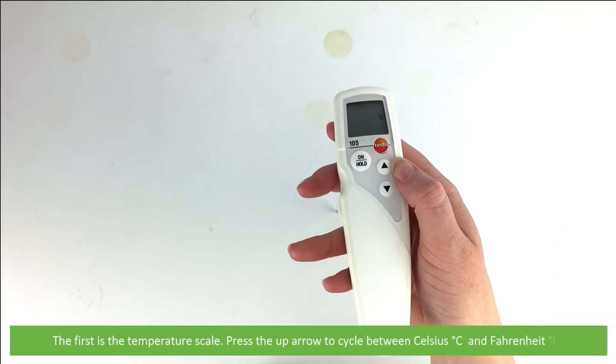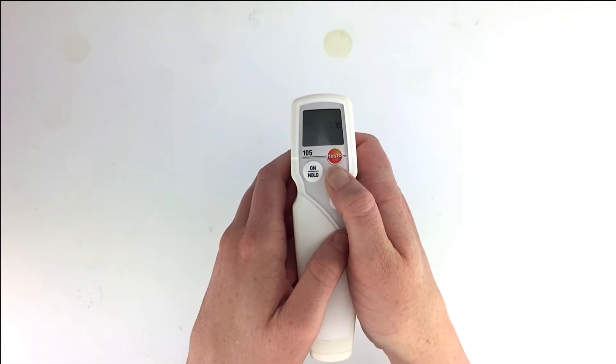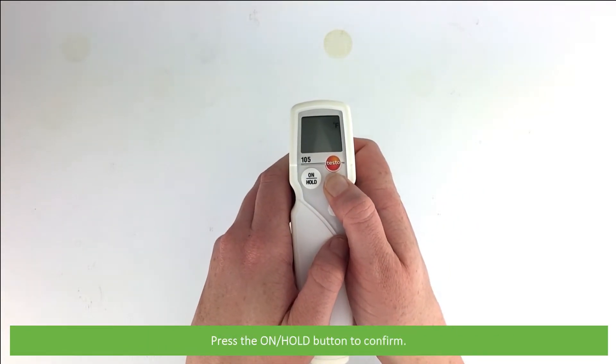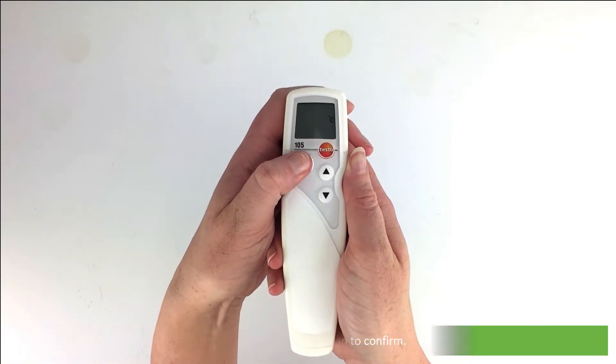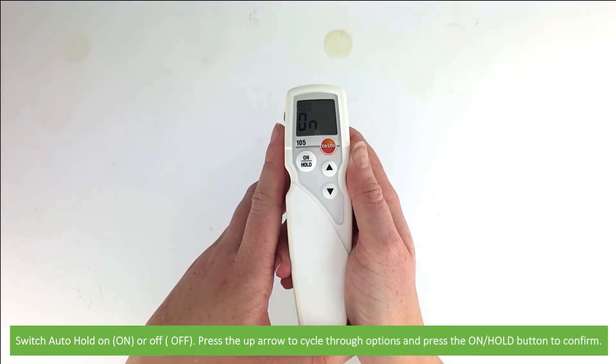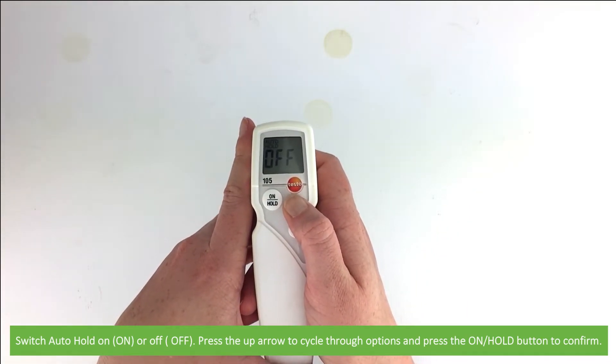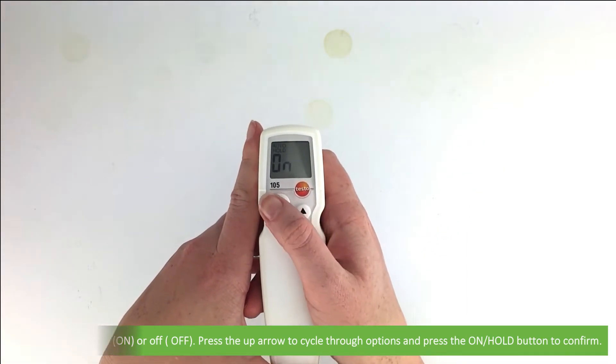The first is the temperature scale. Press the up arrow to cycle between Celsius and Fahrenheit. Press the on hold button to confirm. Switch auto hold on or off. Press the up arrow to cycle through the options and press the on hold button to confirm.